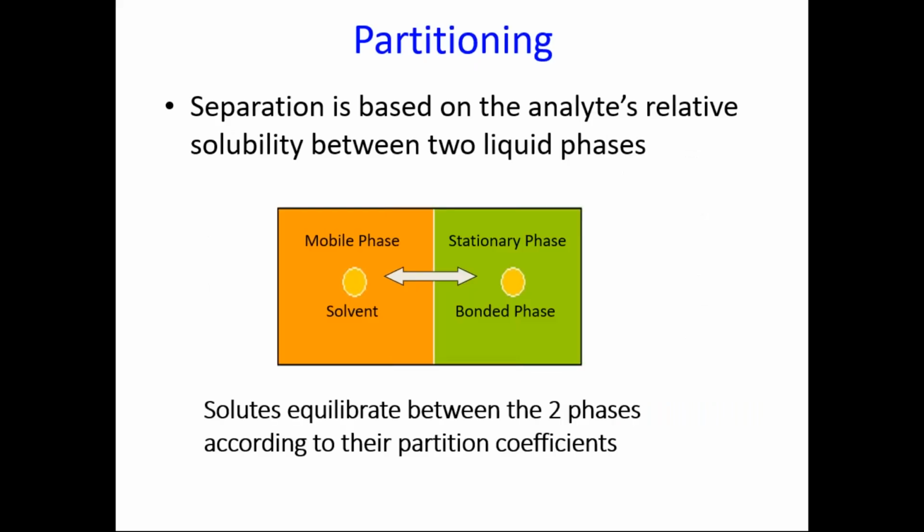The second most important mechanism through which separation occurs is what is known as partitioning. Partitioning of the analyte is based on the solubility of a sample between two liquid phases. Many of you might have used the separation flask or the separatory funnel to separate.